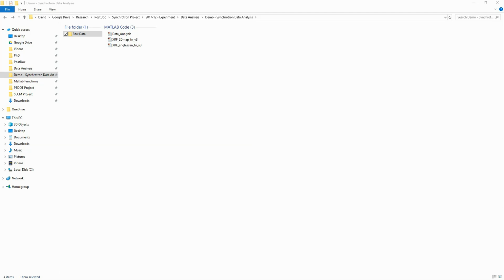Hey guys, in this first video, I'm going to try to show you how to properly save and organize your data so that we can make analysis in MATLAB a little bit easier. So first, when you go to the Synchrotron, you're going to create a folder called raw data, which is going to contain all of the data for your experiment.